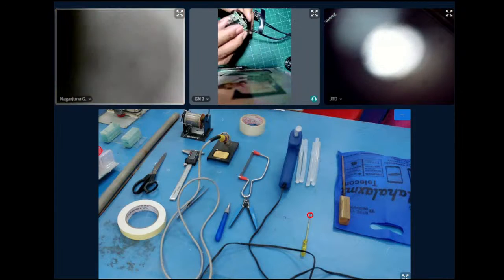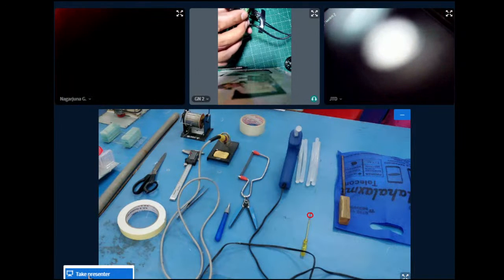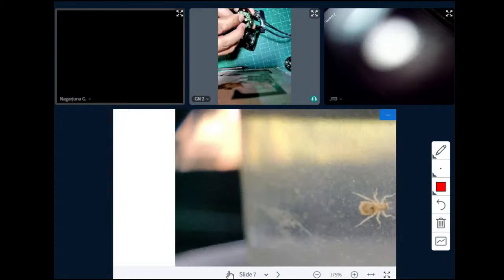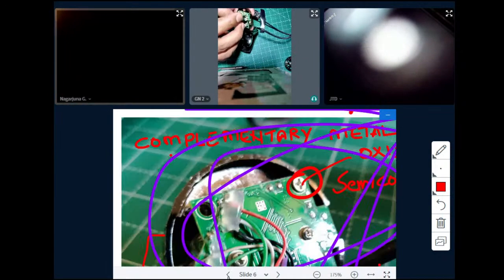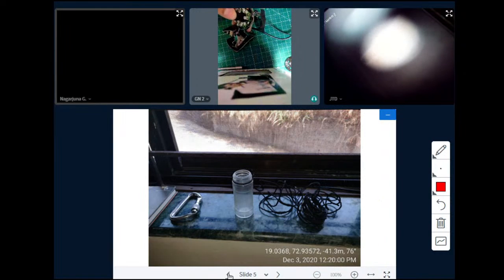So I remember the microscope which I made, we had removed it, and there was this. So I think this will improve picture quality if we block that light also. Yes, tremendous. Of course, we have to completely block that. Right, good point. So right now, I blocked it almost completely. Of course, there is some light coming from the corners. Now you can see it's completely blocked. Yes.